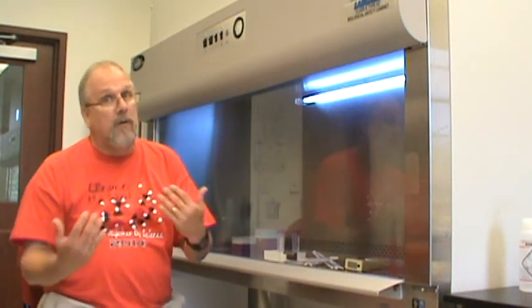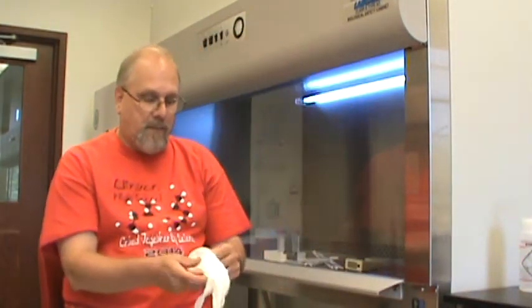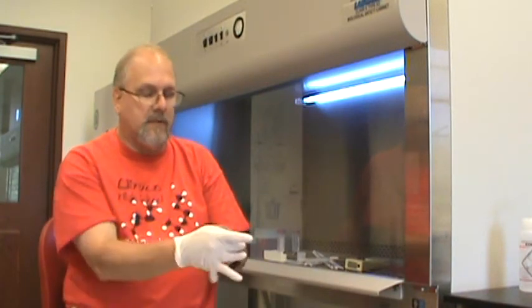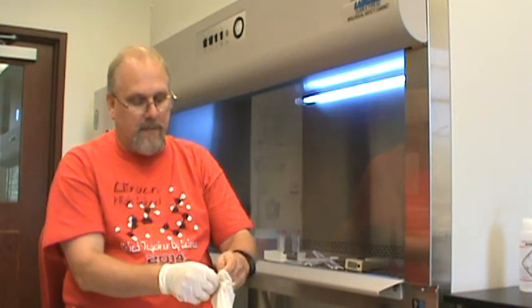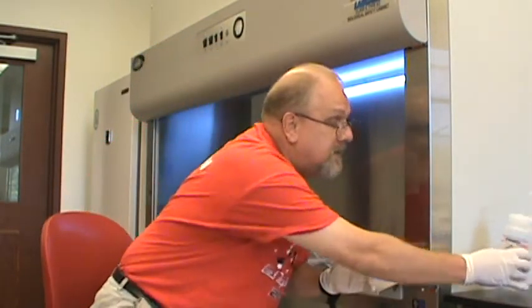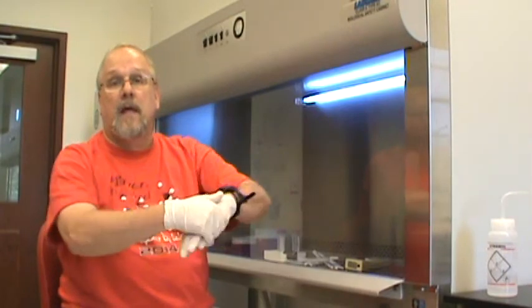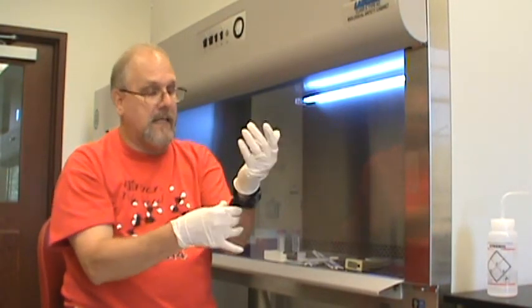If we are going to work in there, we are obviously not sterile. So what we need to do is try as much as we can to prevent the introduction of any kind of contamination into the hood. To do that, we put on rubber gloves and then rinse them in alcohol. This will reduce the chance of introducing any kind of contamination into the hood.